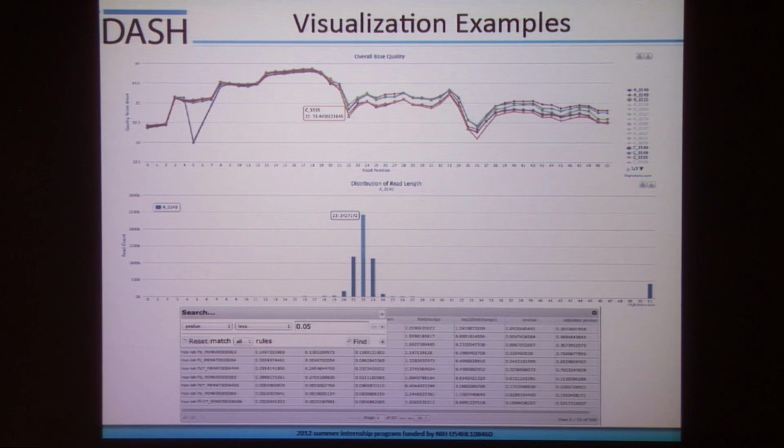Also, another concern that Dr. Burns and Dr. Shimizu said that they'd like to see is to be able to threshold the data for differential expression for microRNA. And so I inserted a filter for this table here because they said they would like to see microRNA with a p-value of less than 0.05 because they find that to be very statistically significant for their data.